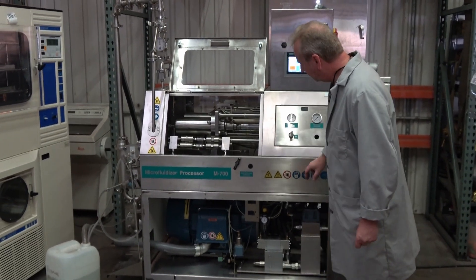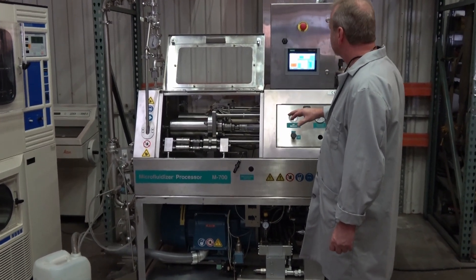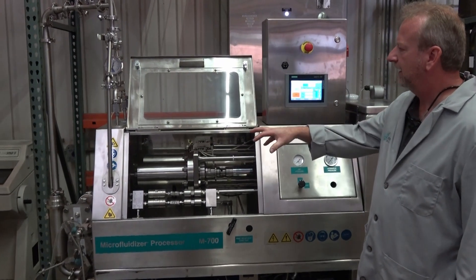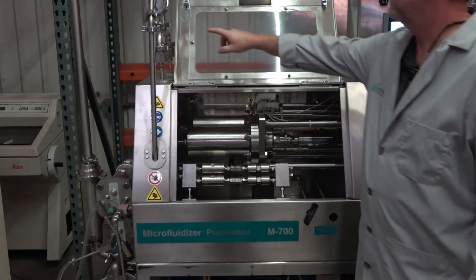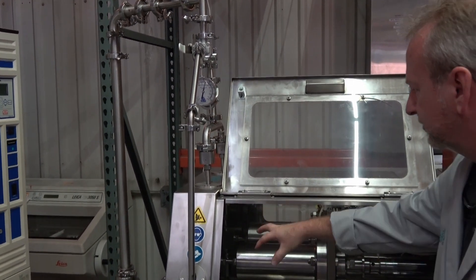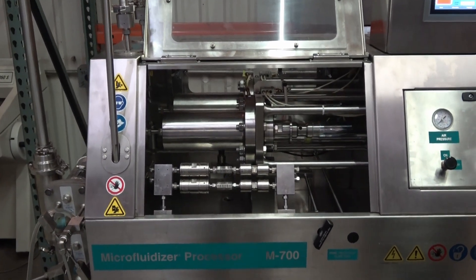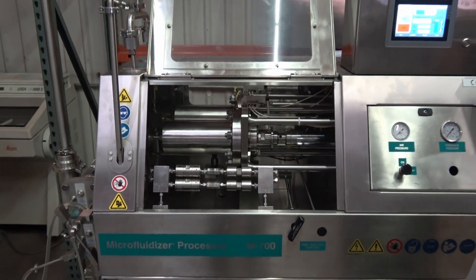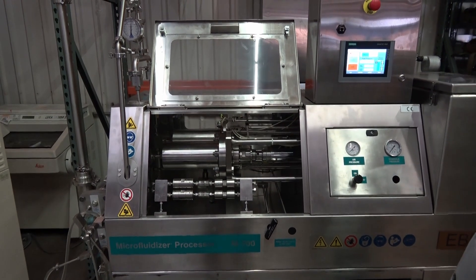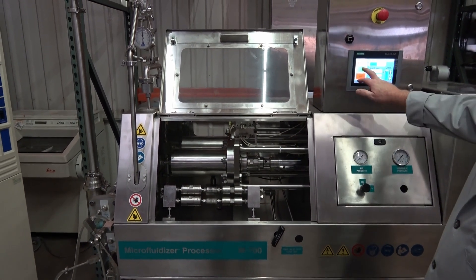You can see it's in very nice condition on the inside. We do have the pneumatic pump hooked up right now — we've got pressure coming in, which is required to pre-feed the actual high pressure pumps. That's running right now and all we need to do is turn on the motor and then activate the pumps.